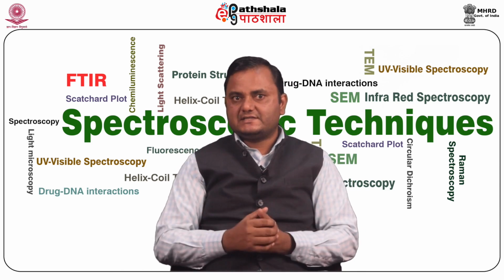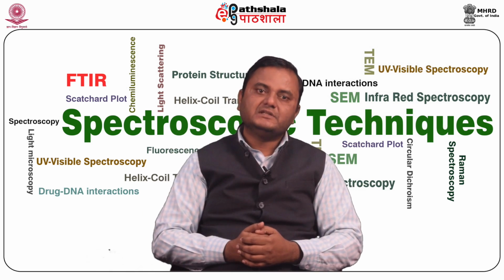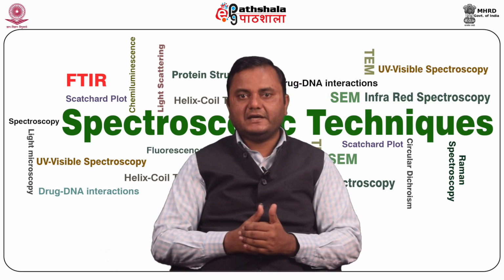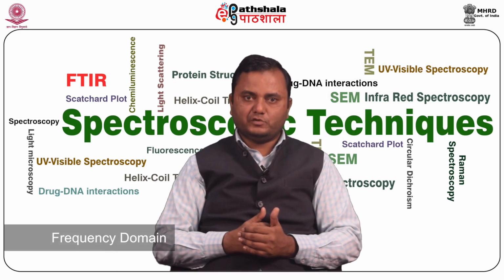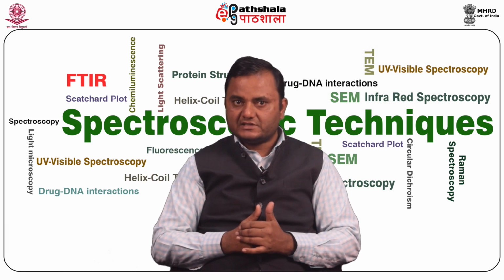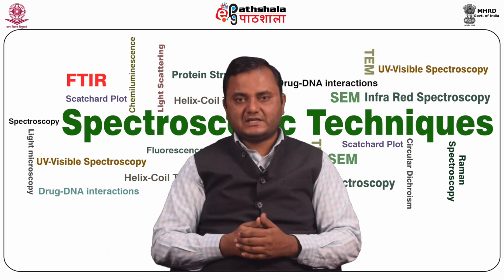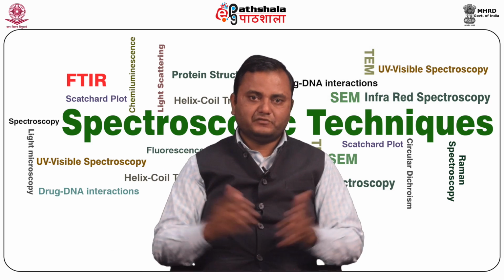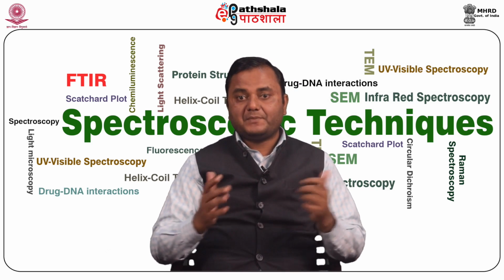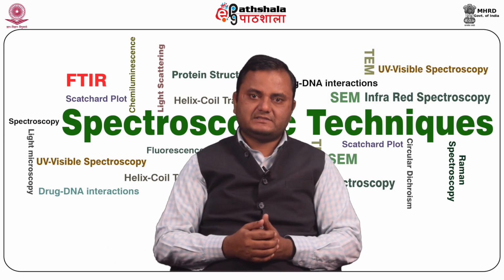So now we can discuss what the Fourier transform is. You first need to understand what the Fourier transform is. The Fourier transform defines a relationship between the signal in the time domain and its representation in the frequency domain. Being a transform, no information is created or lost in the process, so the original signal can be recovered from the Fourier transform and vice versa. The Fourier transform of a signal is a continuous complex valued signal capable of representing real valued or complex valued continuous time signals.